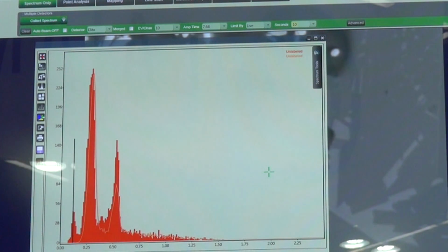Though I will say, when we're down here, try to look up the theory for the position of the L lines and figure out what the background correction should be at L lines. This is somewhat unexplored territory. Silicon L lines, the exact position will depend on the binding configuration. We're so far down that we're starting to have valence electrons involved in these transitions. And the valence electron energy depends on the binding configuration.